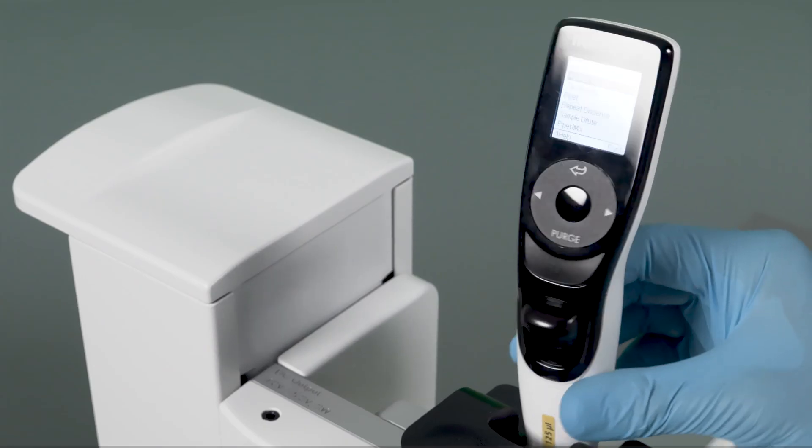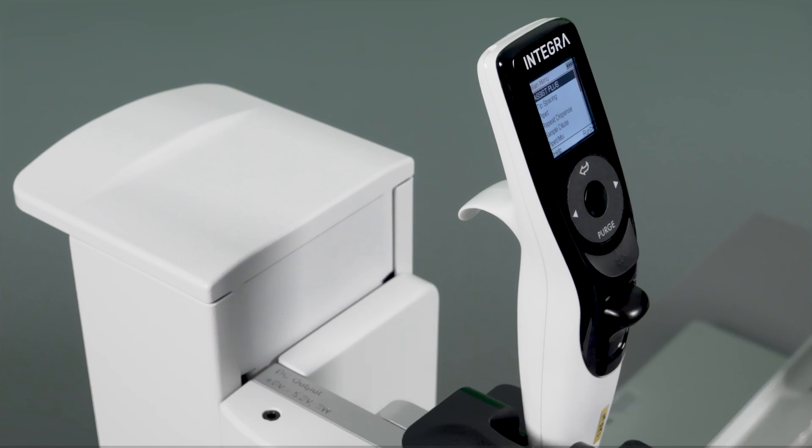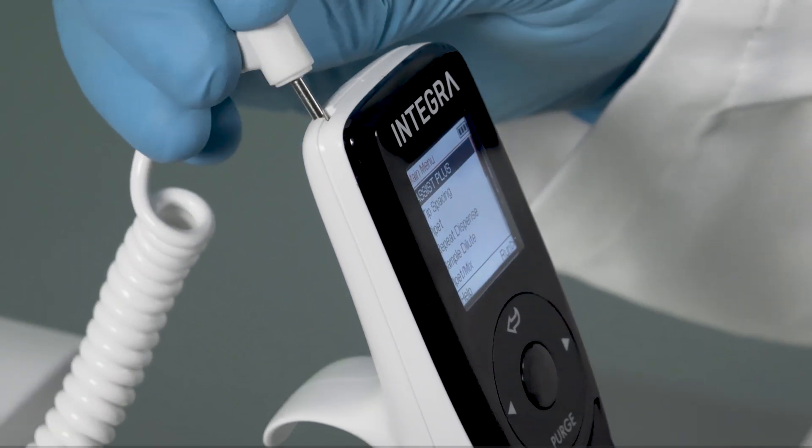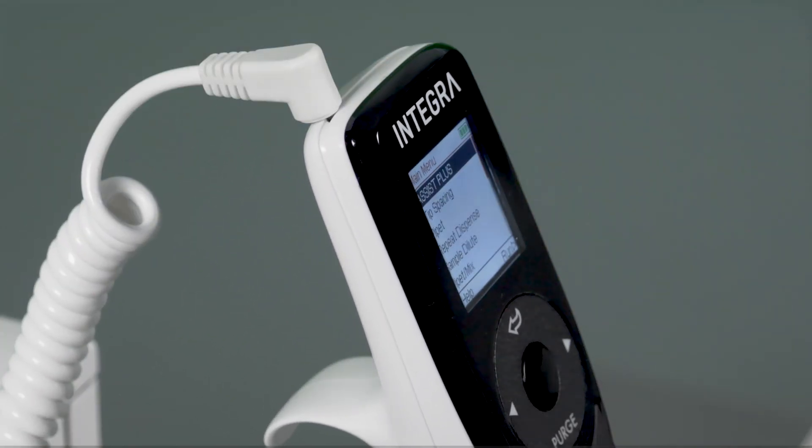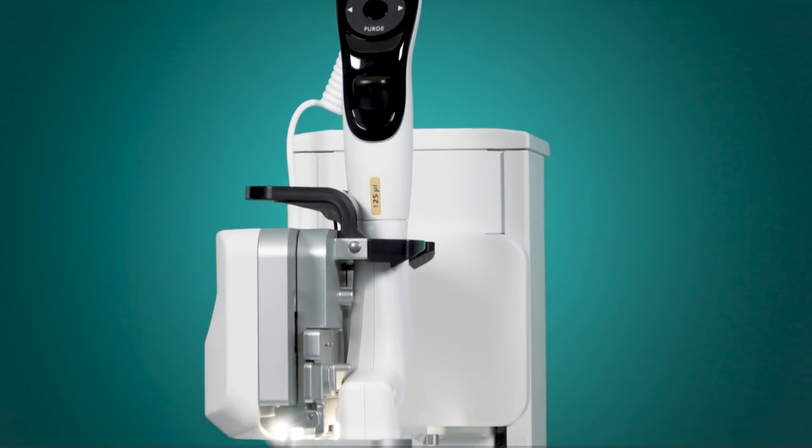Twist the pipette so that the display faces the front. Finally, connect the pipette charging cable to keep the pipette charged while it is installed in the instrument.